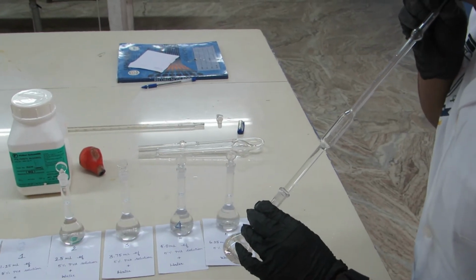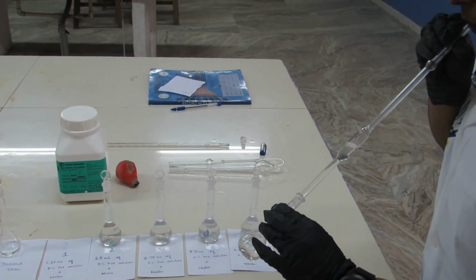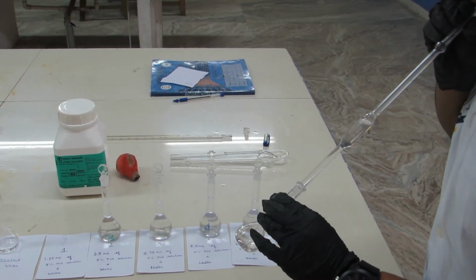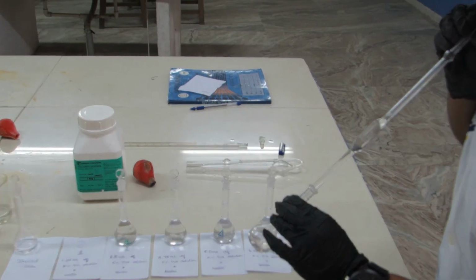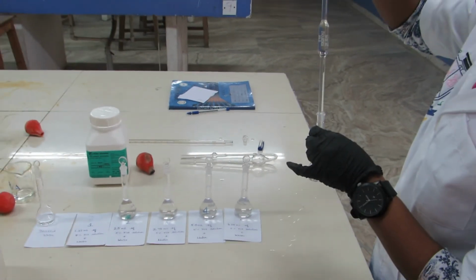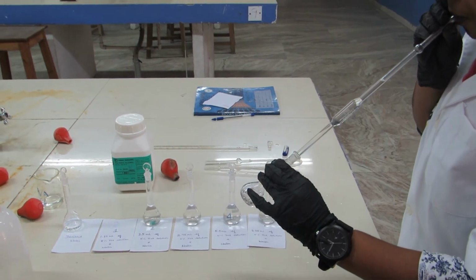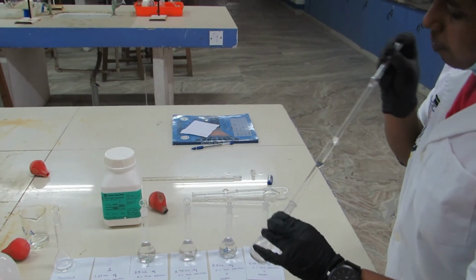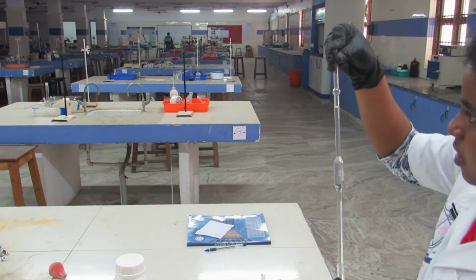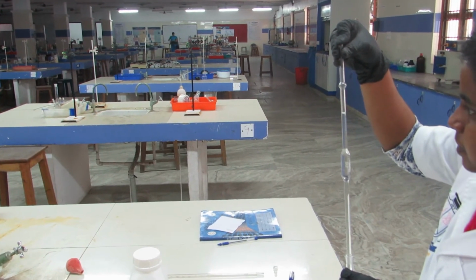We are pipetting 10 ml of 0.25% polyvinyl alcohol, and we are taking that 0.25% PVA solution into our viscometer. Okay. Exactly, we should take 10 ml only. Prior to this, we can rinse the pipette with water once.